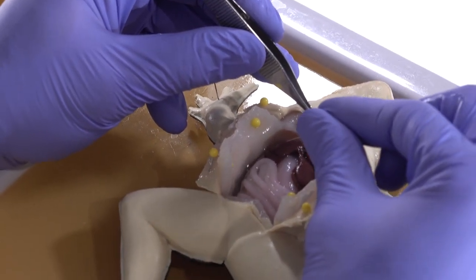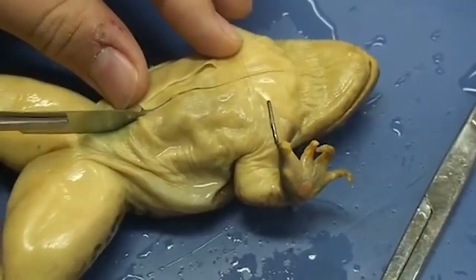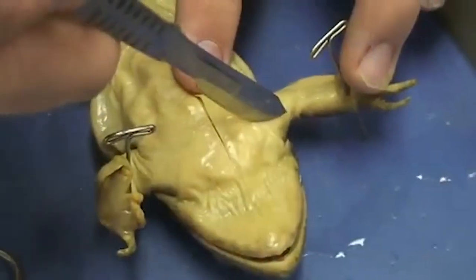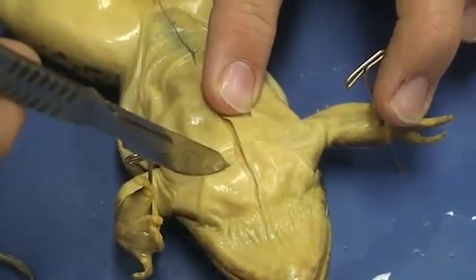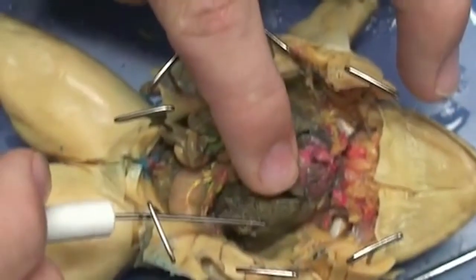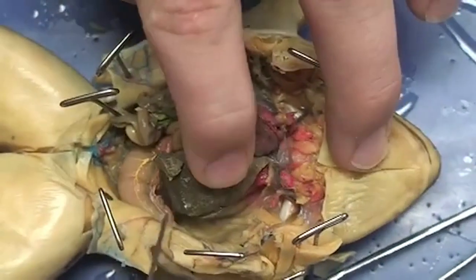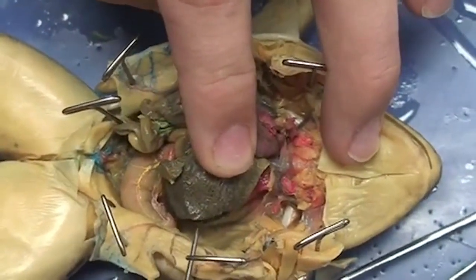It's designed for high school and middle school dissection. The frog in particular is superior to a real frog, superior for a number of reasons. When you use a preserved frog, you essentially have a sack of what looks like chewed-up tobacco. It is a real frog, but there's a bunch of stuff in there that's really hard to identify. It's definitely not live tissue and it doesn't look like live tissue.